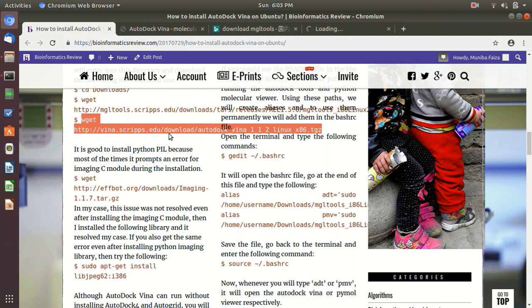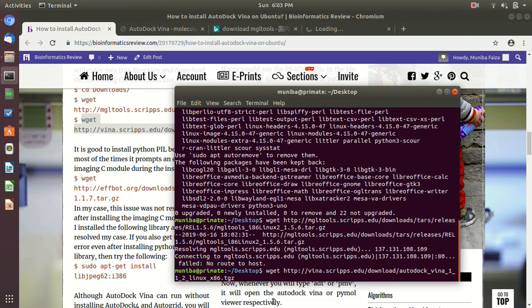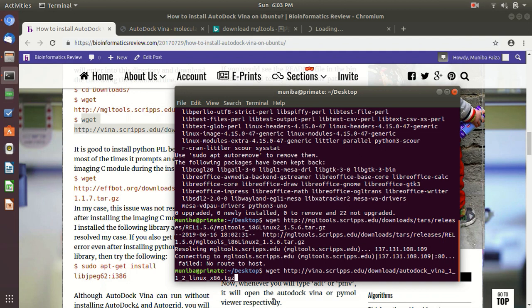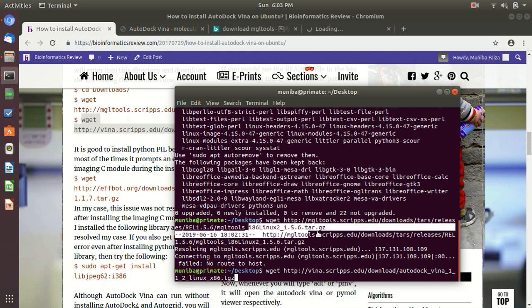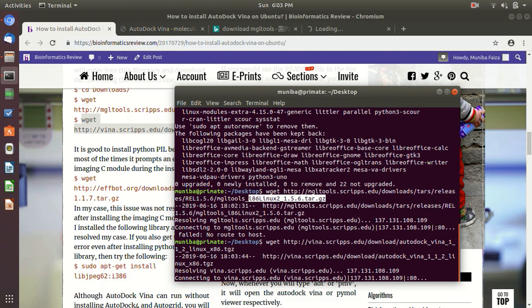You can install AutoDock Vina using this command. Also, you will have to look for your system, because either your system supports the 32-bit or the 64-bit. Okay, so be careful while you are downloading the MGL Tools package. It is very important which version you download for which platform. Okay, so just hit enter and it will download it.